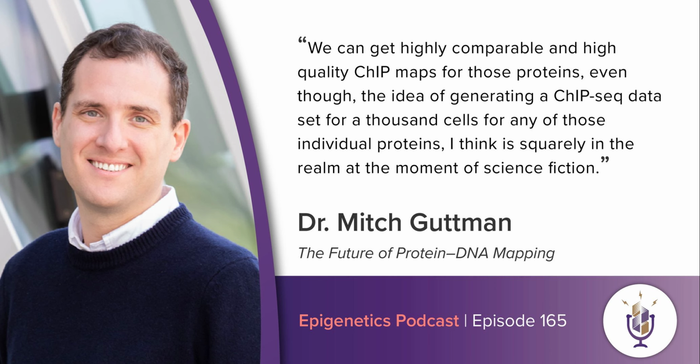We then take these bead-oligo-antibody conjugates, mix them together, and use this pool of beads and antibodies to perform our immunoprecipitation reaction. So just like we would do immunoprecipitation for a traditional ChIP experiment with a pool of beads and a single antibody, here we would use a pool of beads with this mixture of different antibodies, where the oligo effectively demarcates the identity of the bead type.